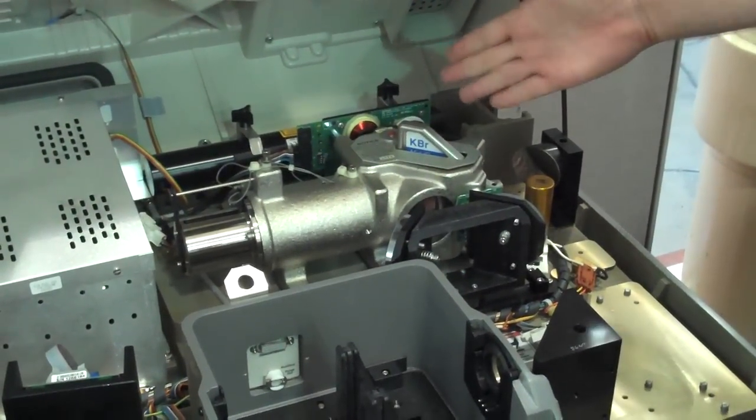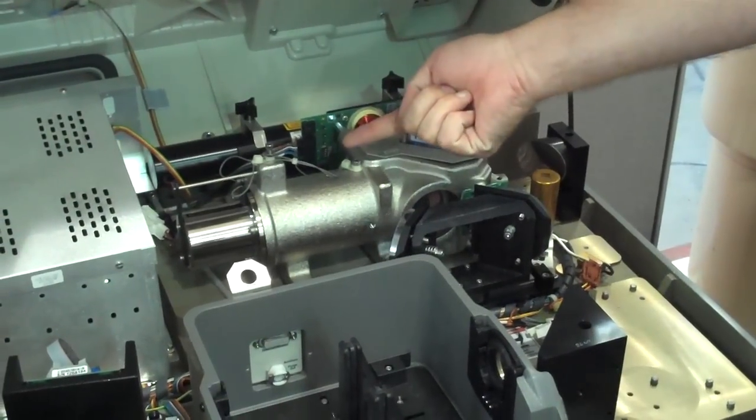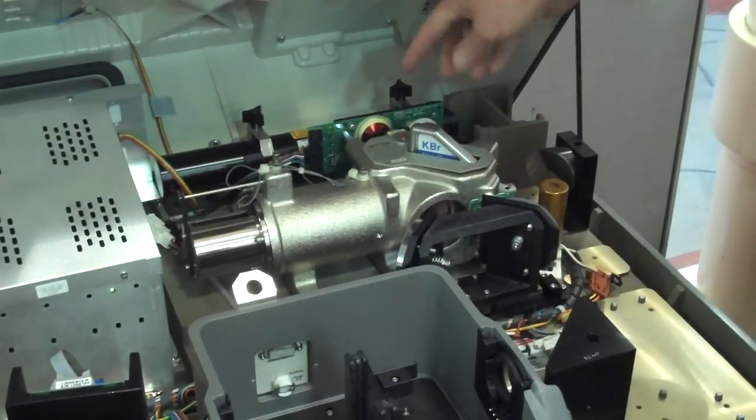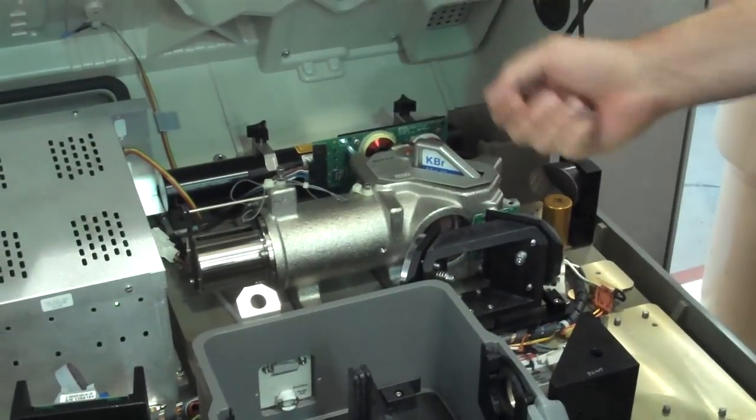This is where the light is split into two parts. There's a beam splitter. Part of the light goes one way, part of the light goes the other way. Then it gets recombined. The interference pattern of that is what we then measure.